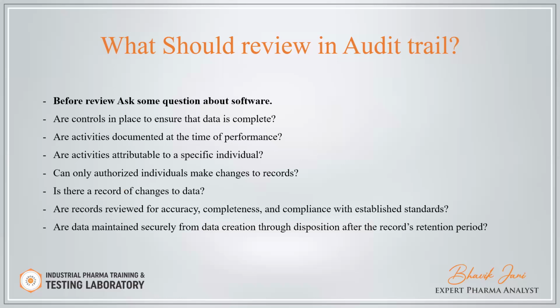Before review, ask some questions about the software. If you want to prepare any risk assessment and you have any question about what should be reviewed in an audit trail, these 7 questions give the answer to each and every question. Like, are controls in place to ensure that the data is complete? Your data should be complete, so you have to ask what we should do to say that my data is complete.